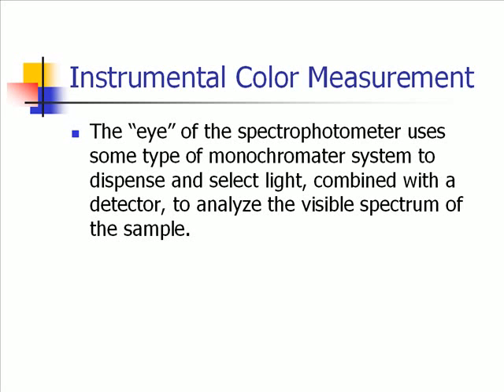They've gotten samples read very incorrectly. Example, there'll be a color on one side, and then there'll be white on the back side. Ideally, when you put it on the instrument, you put the colored side towards the detector, so it measures the color. But they've had instances where they flipped it over and put the wrong side facing the instrument, and obviously you're going to get a bad reading. You're not going to get the same color.